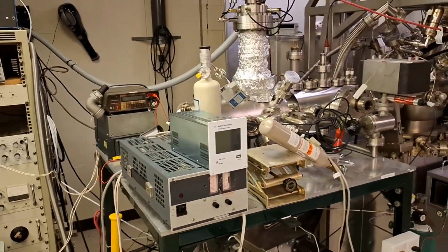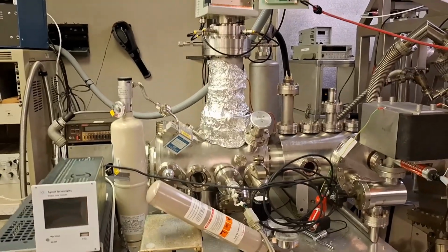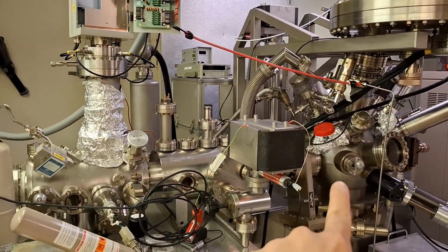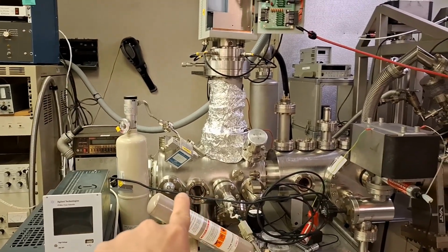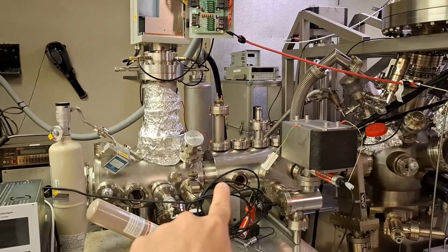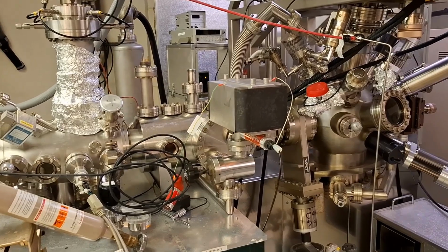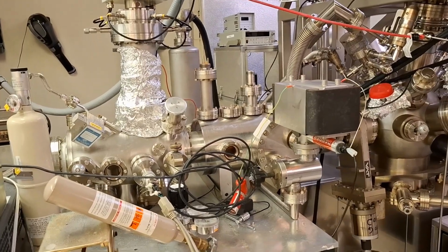This is one of our UHV systems, and I will just talk about the thin film part. So you can see our UHV system. There are 3 chambers. This is the first chamber, this is the second chamber, and this is the third chamber. The single crystal or the sample can go from the first chamber to the second chamber and from the second chamber to the third chamber. So there is a mechanical system and we can move the sample without breaking the vacuum.